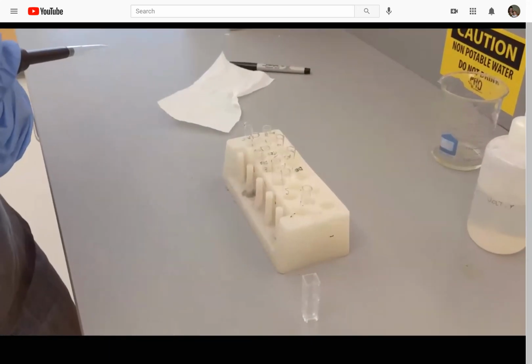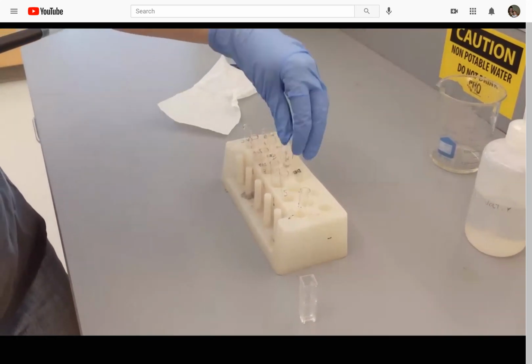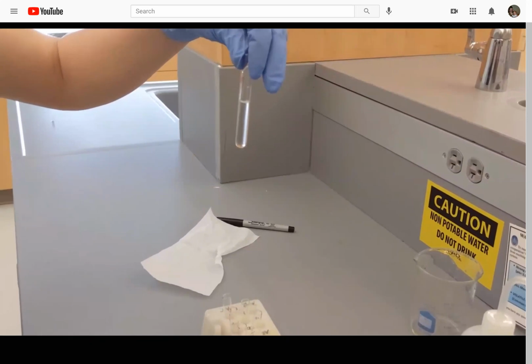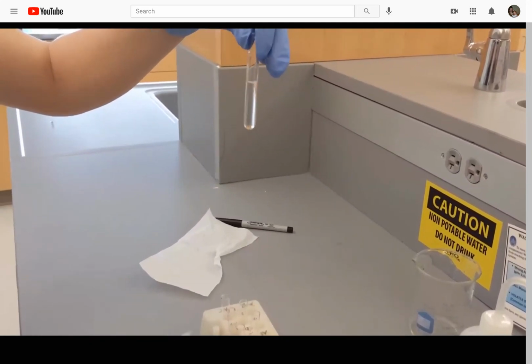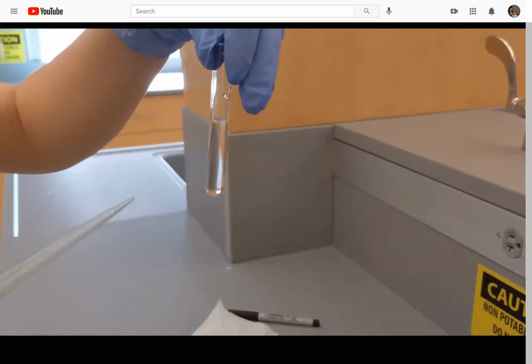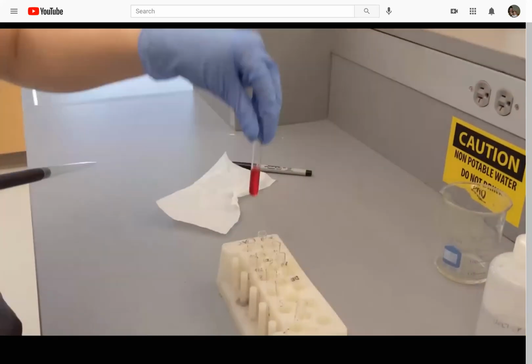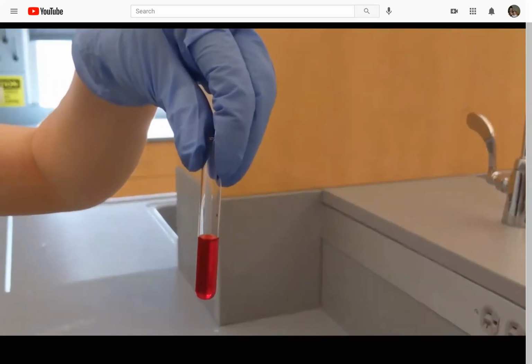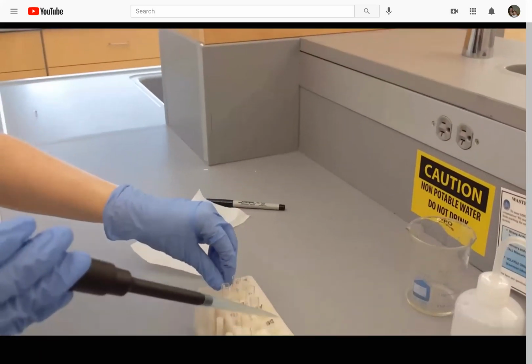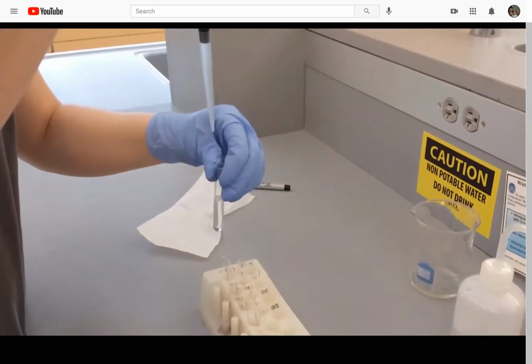So I'm now going to measure the absorbance of each of my diluted samples. I'm going to start with the most dilute so that I don't contaminate the cuvette with essentially staining it red or additional red drops. So if you note, this solution is almost clear, where my standard solution is this bright red color. So we don't want any of this getting in the more dilute samples. So we always go from most dilute to most concentrated when we're measuring absorbance.